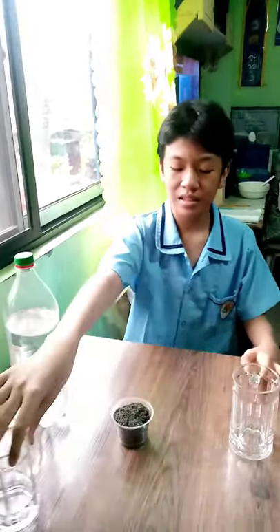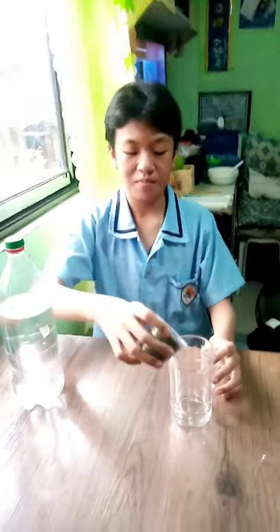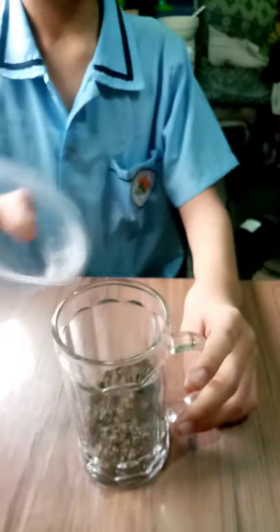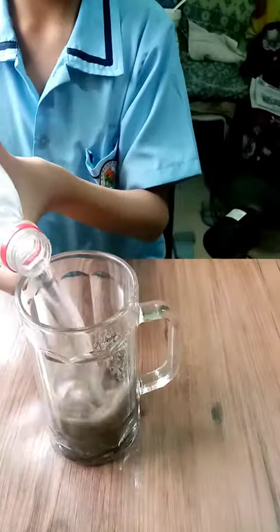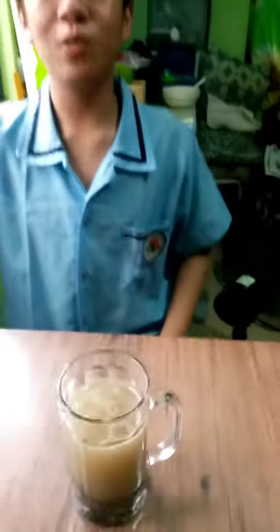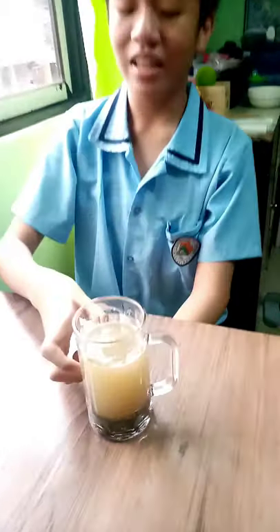First, we will set aside this glass. Then, we will put the sand inside the cup. Then, we will put the water inside. After that, let's mix. After two minutes, this is what it looks like.